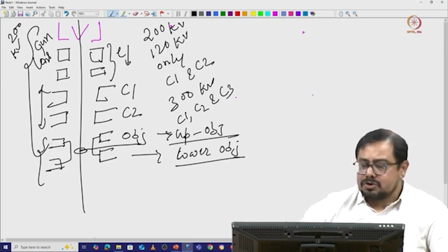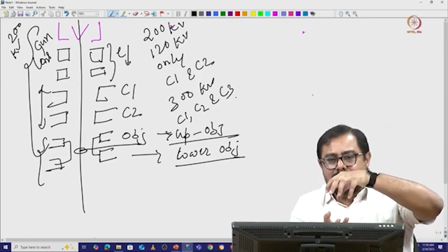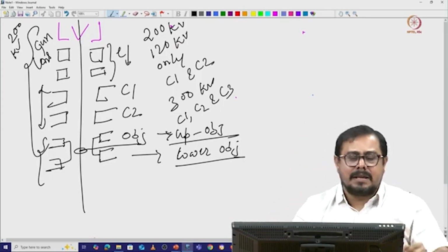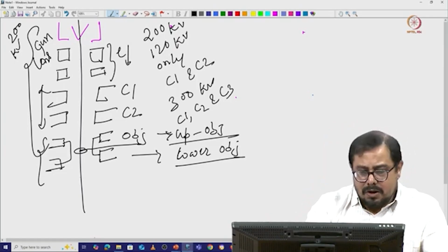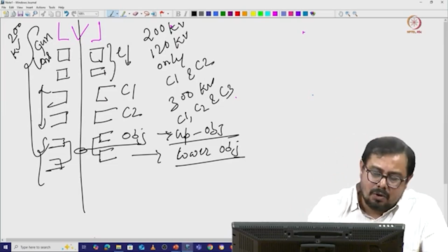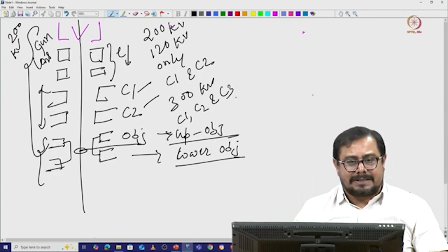Most of the time when there is a light source for a light microscope, it will directly first interact with the sample, and then the objective lens and our eyepiece and other things. Here the electron beam first comes out from the gun lens, then goes through the accelerating stack, increasing the speed, then goes through condenser lens 1, condenser lens 2, and then goes through the sample.